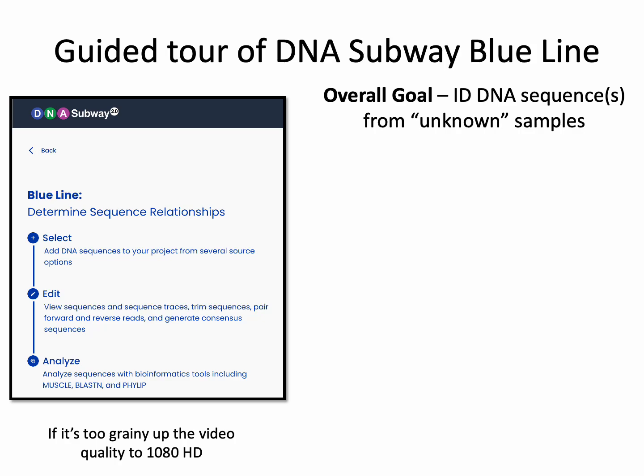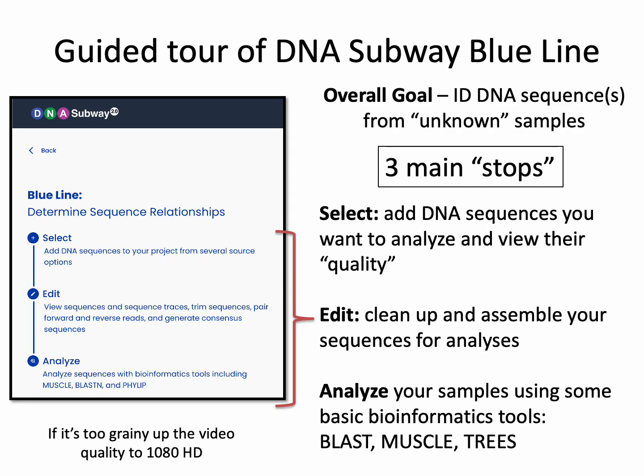Hello, this video is a guided tour of the DNA Subway Blue Line. The overall goal of the Blue Line is to help you clean up, analyze, and taxonomically identify the DNA sequences from samples you've collected. The DNA Subway Blue Line has three main stops.